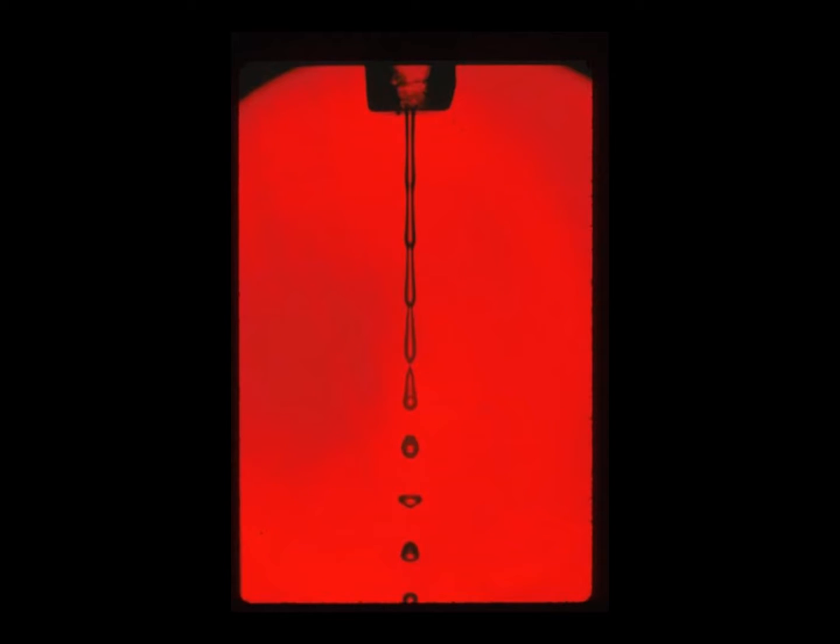Now we see a little bit lower down, we see the stream pulsating very well, droplets being formed. And this is a stroboscopic picture, meaning that the light is flashing in synchrony with the formation of the droplets, the same frequency as the piezoelectric crystal is shaking the nozzle. And so you're seeing thousands of droplets superimposed upon one another in a time picture, sort of. And so you see the absolutely constant formation of thousands of droplets with a particular shape and particular position.